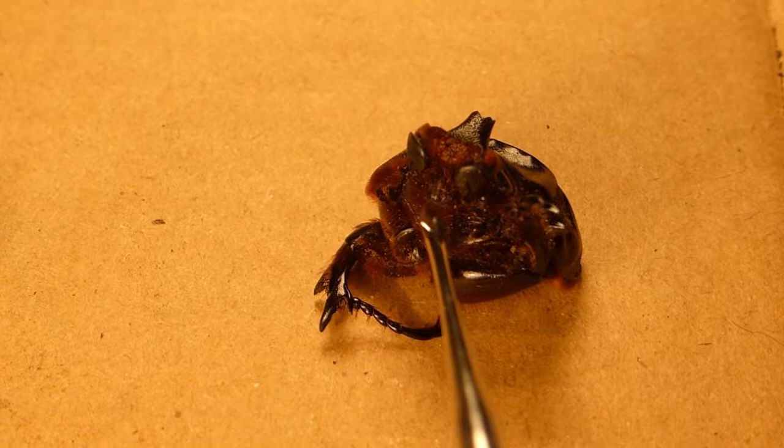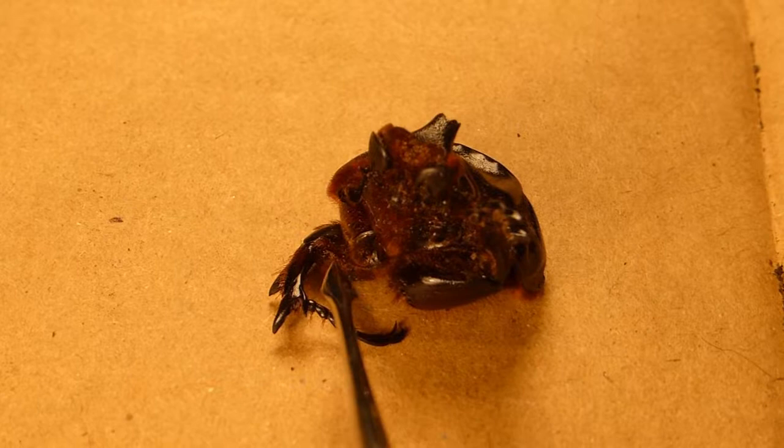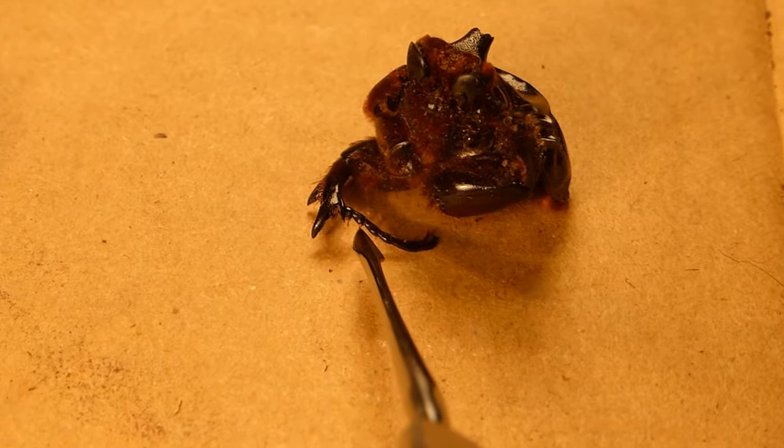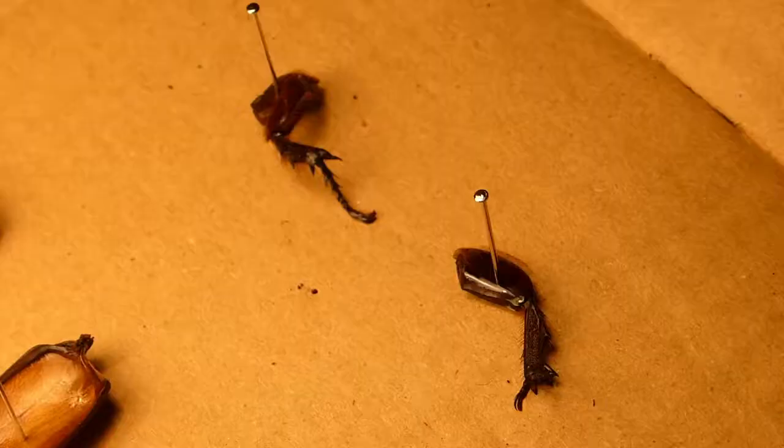This is the ventral view of the second beetle. You can see the eyes here are actually even more pronounced than in the first one. Also, the antennae are much clearer here, so you can see these structures here are the antennae. This also gives you a lovely view of the forelimb. This one actually has the tarsus here, which is the distal segment, and you can see the joints in it. Beetles are arthropods, which are things with jointed legs. This includes all spiders, crustaceans, and insects.